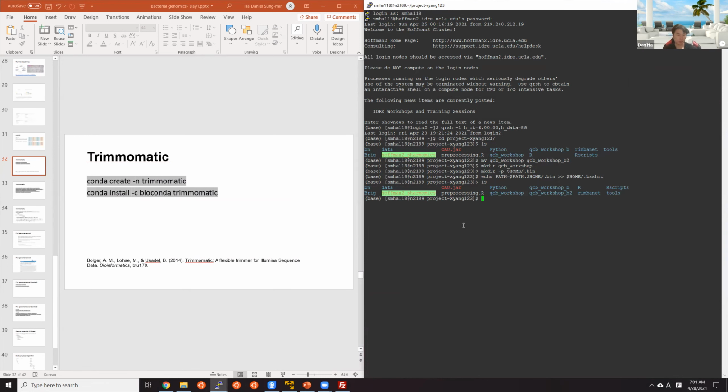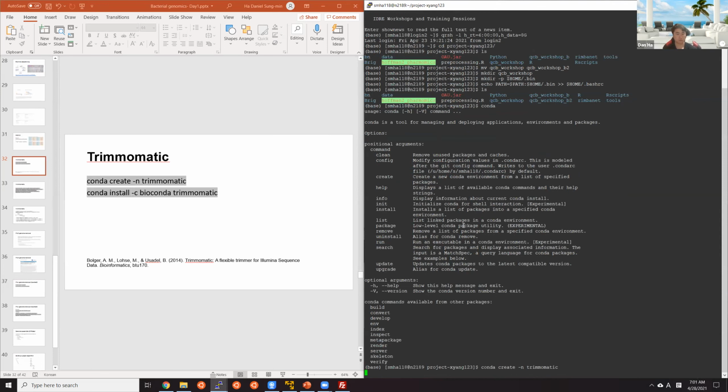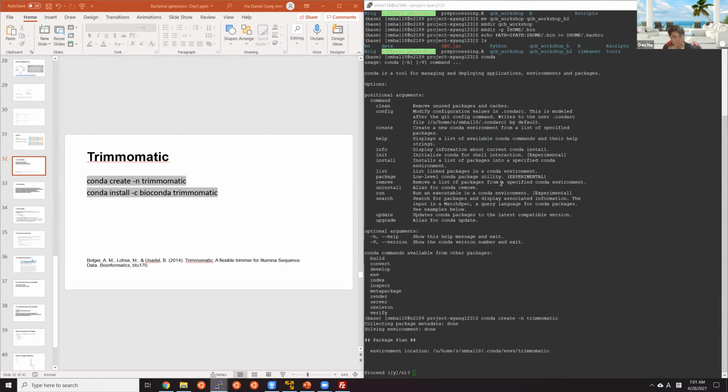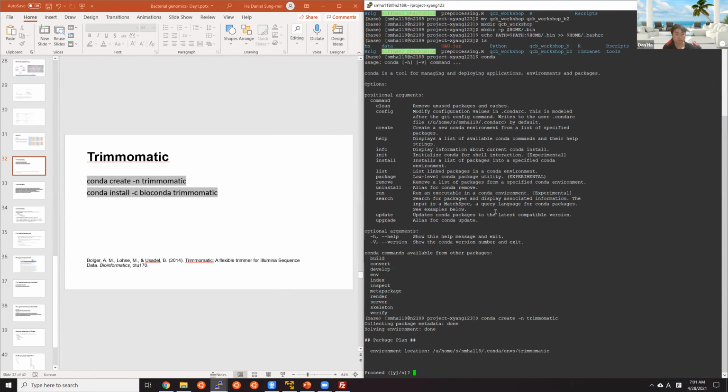So let's create a Conda environment. Create -n Trimmomatic. It's gonna ask you to proceed.